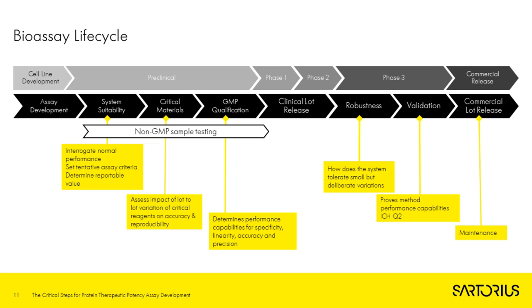So some key stages are the system suitability studies, where we can start to understand the performance of the methods and set tentative system suitability criteria for what constitutes the test's validity on a day-to-day basis.